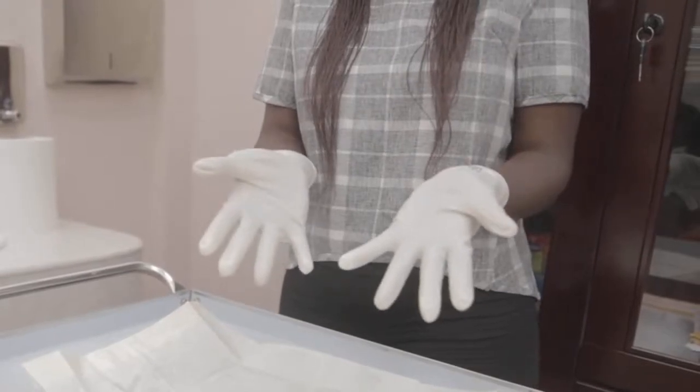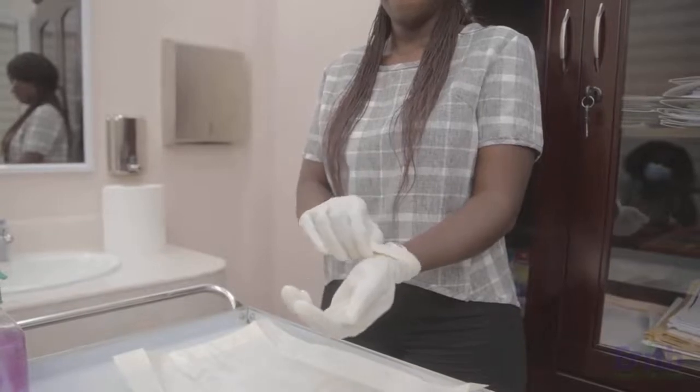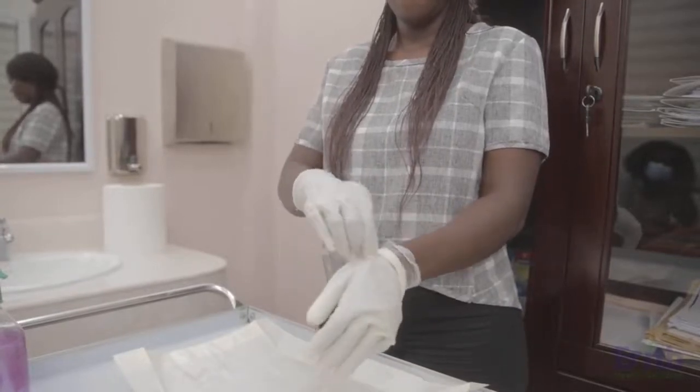Avoid allowing the outside surface of the gloves to come into contact with your skin, and do not let the gloves snap, as this may cause contamination or contaminants to splash into the eyes, the mouth, the skin, or other areas. Remove used gloves before touching anything.